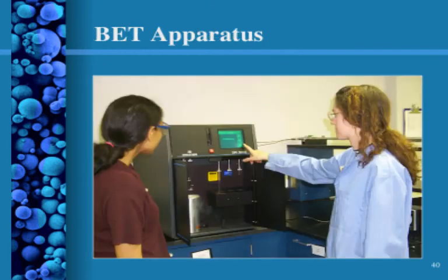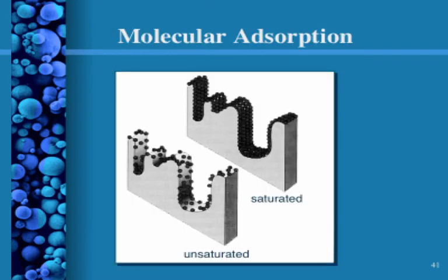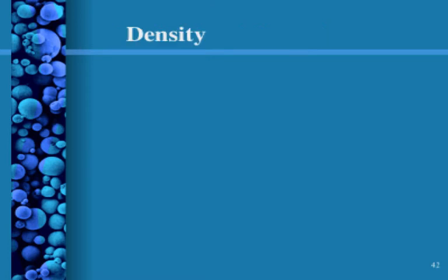You can use BET, but there are other methods available as well. In BET, you're looking at gas adsorption, and depending upon the surface area available, you can adsorb more gas molecules. There are isotherms available as you change pressure and temperature, and you can get coverage of gas molecules by desorbing them.